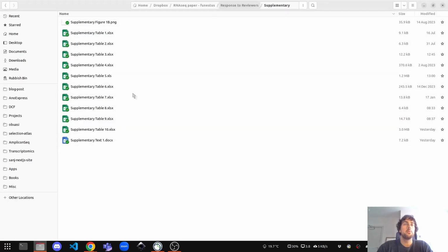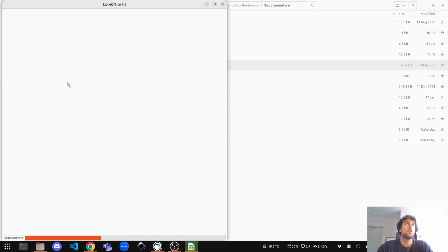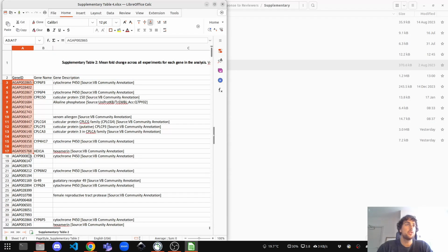And in the meantime, I'm just going to make a new file which has a list of gene IDs.